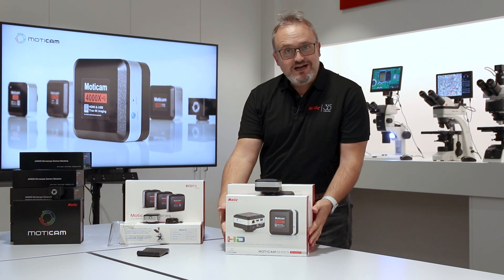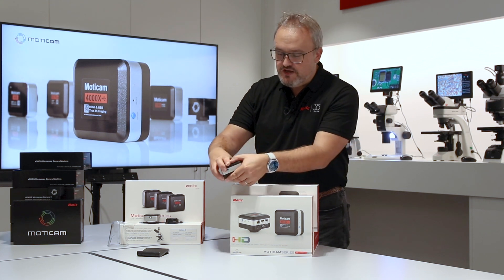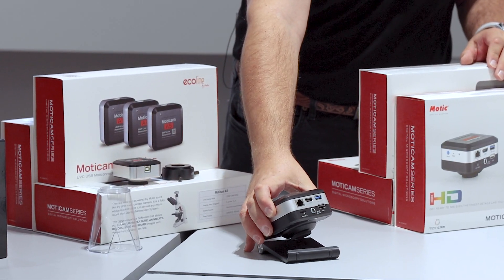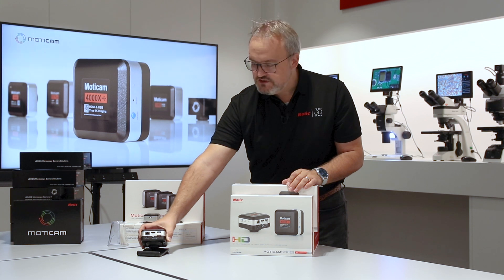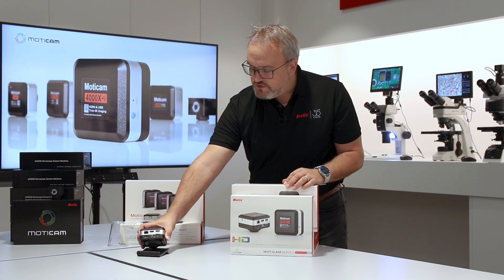We have the multiple output line, so this consists of cameras that may have HDMI, USB, SD card, or wireless — combined or each on their own outputs — so that you may not necessarily need to use a computer to facilitate capturing, annotation, measuring, and learning from the image.